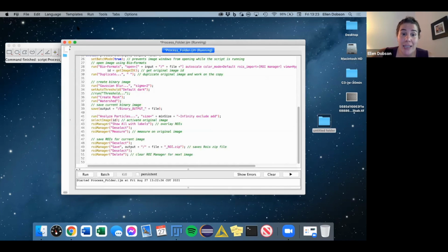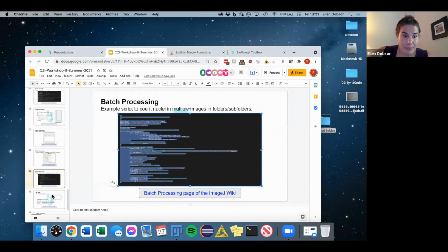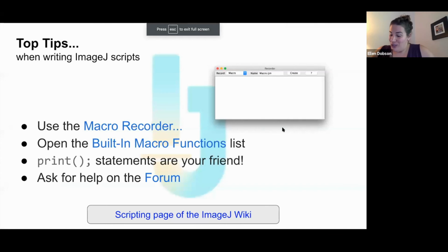So this text example in the slides is here for you to use. If this is something that's applicable, you can also modify it for whatever you need. But this is to kind of get you out there swinging. So, okay, we're at the end.